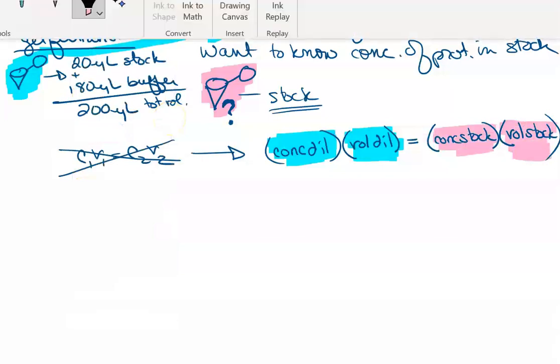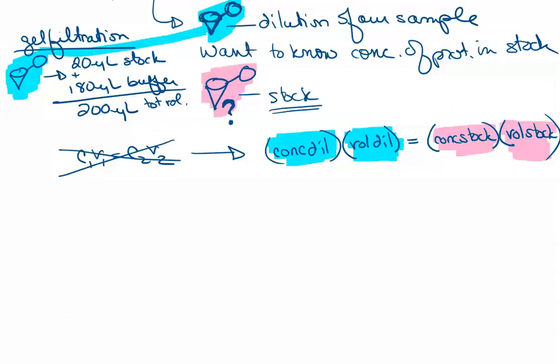Let's set up this equation with some numbers, okay? And let's say that when we solve the line equation, we found that the dilution concentration measured, the concentration equals the A595 minus the y-intercept over m.